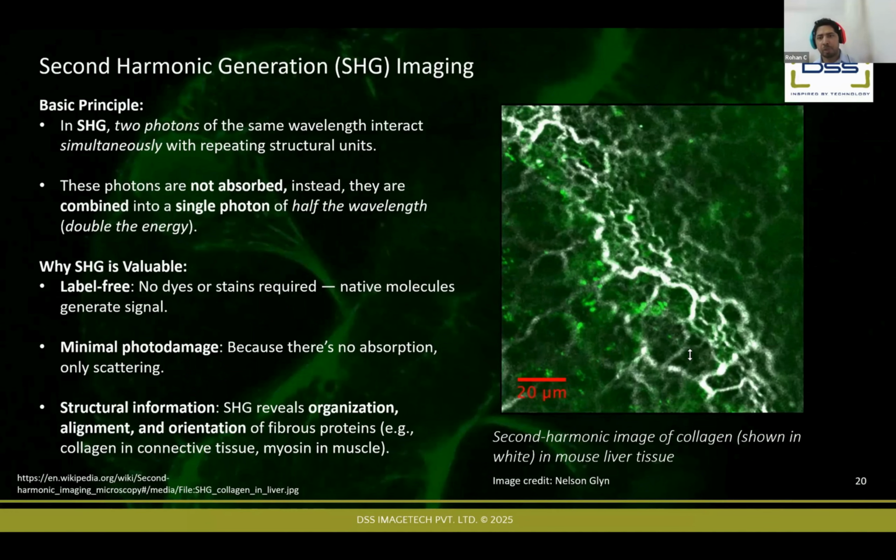are you referring to what kind of material the multiphoton laser is using? Because here we are not crystallizing any proteins. The proteins are there within the living tissue or the intact tissue. And because of the structural properties of the protein, we are essentially getting this second harmonic and third harmonic generation. So we are not crystallizing the proteins. I'm not sure if I answered your question. Feel free to also come in for more clarification.